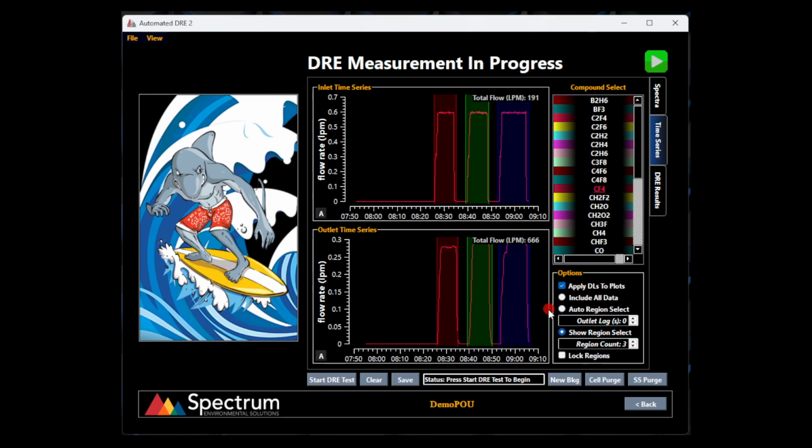And then once I've gotten everything the way that I think is perfect, I just hit the save button. And when you hit the save button, do not worry, it doesn't override anything that you've previously done. It always writes a new file, so there's no loss. No information can get lost. So save as often as you want. But yeah, so this would conclude part two.